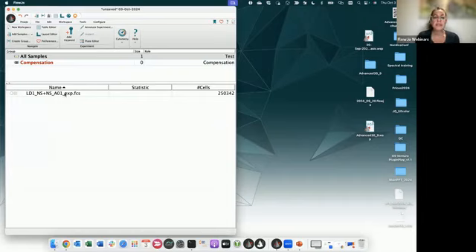Sometimes I get the question: I don't see the name of the file the way I labeled it at the instrument. I see a super short file name, something I really don't understand, and it's not the way I named them.